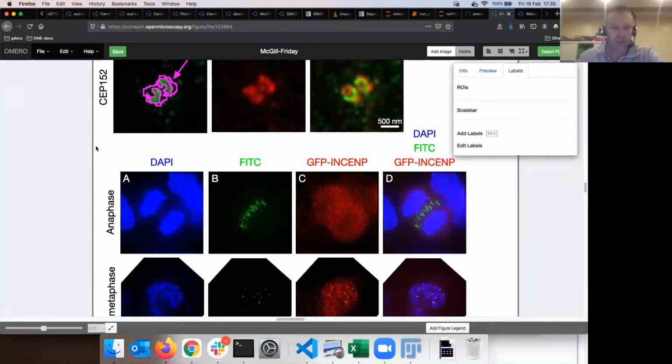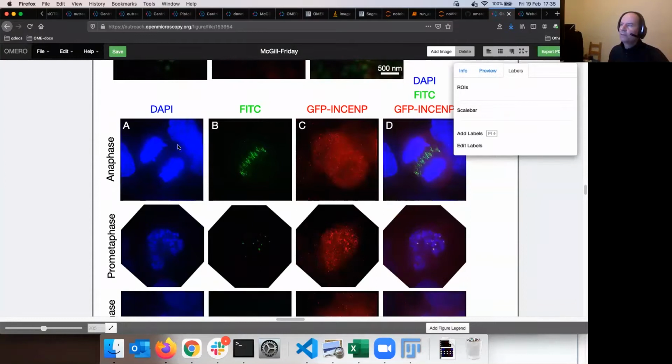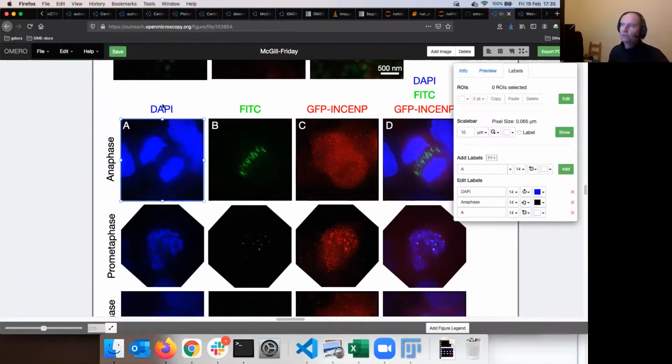That may be a feature to consider. Great, it becomes all wired, basically. Yes, I think this is kind of coming to the question of out-of-panel ROIs, which Will gets as well very often. I think he even has an issue, but we will check the status of the issues and maybe open a new one for this one particularly, because of course, as the work progressed on the figure, the panel-bound features, so to say, were thought of first. So all of those labels are panel-bound. This DAPI is definitely bound to this panel.